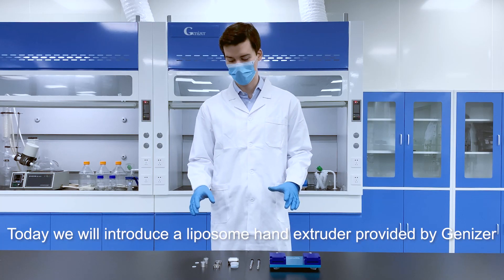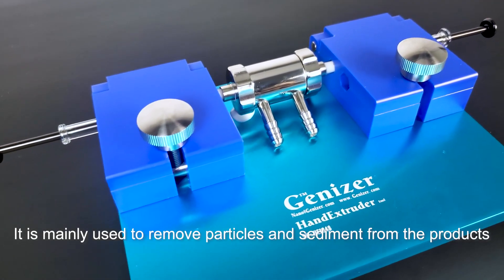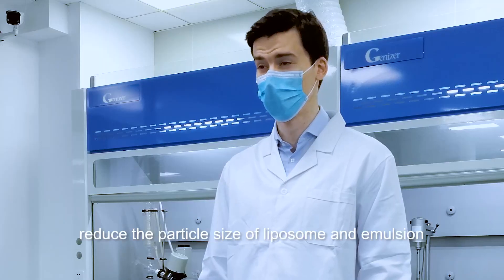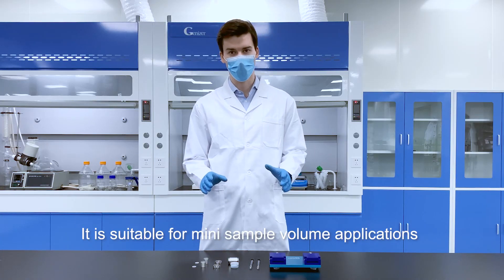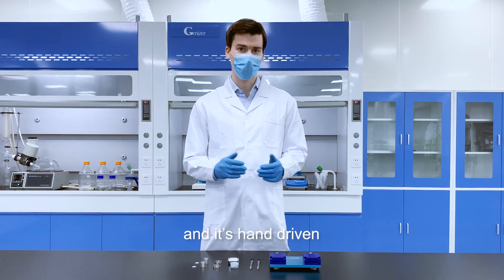Today we will introduce a liposome hand extruder provided by Genizer. It's mainly used to remove particles and sediment from products, reduce the particle size of liposome and emulsion to facilitate sterile filtration. It's suitable for many sample volume applications during the experimental phase, and it is hand driven.